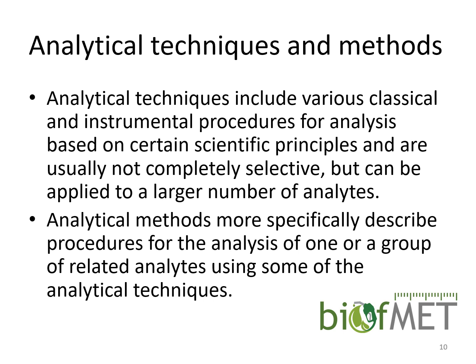When it comes to analytical techniques and methods, first we need to, of course, distinguish between techniques and methods. So a technique would be some scientific principle or classical instrumental procedure for the analysis of some group of analytes with similar physical and chemical properties. An analytical method would be more specifically specified in terms of analyzing a particular analyte or particular groups of analytes, making it more selective, so you can have, of course, several methods by application of one analytical technique.